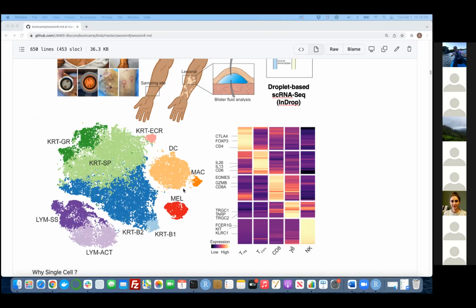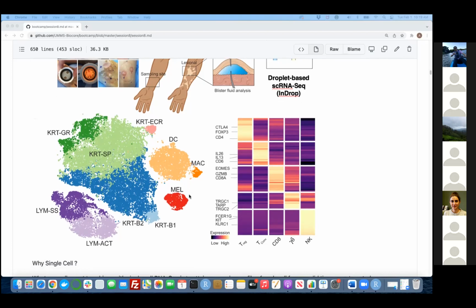So basically the fundamentals of single cell analysis is that you're trying to understand what different expression profiles, groups and clusters there are in the data, and then you look up their genes and which of those genes are high in which of those clusters. And we're going to start telling that, okay, these are definitely T cells because they have CD3, and these are definitely melanocytes because they have TYR or PMEL, those genes that are really indicative of cell types.